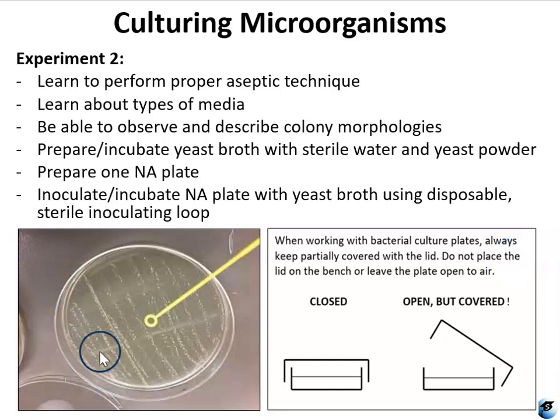And you're just, again, going to use a simple streaking pattern on the nutrient agar. And you're going to incubate that for 48 hours at room temperature. And while you are inoculating this plate, be very mindful of your aseptic technique. Make sure you're keeping it at arm's length. Make sure you're keeping the plate covered as much as possible.